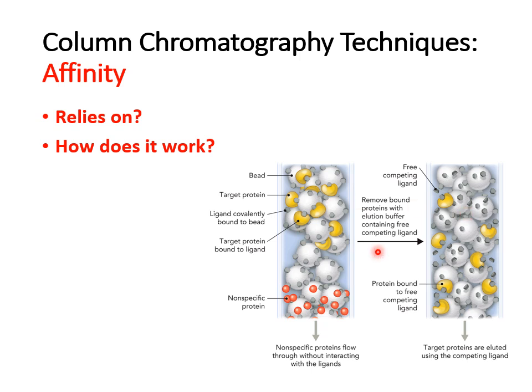And when we look at affinity chromatography, you can also use this with an antibody column that can be used to isolate antigenic proteins too. And we'll talk about that in later slides and later lectures as well.